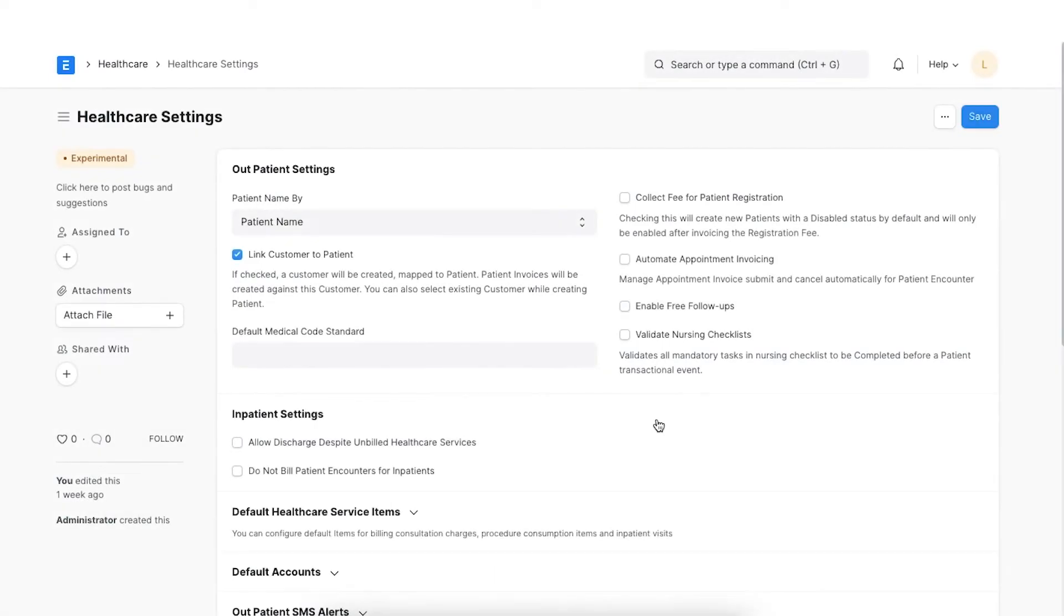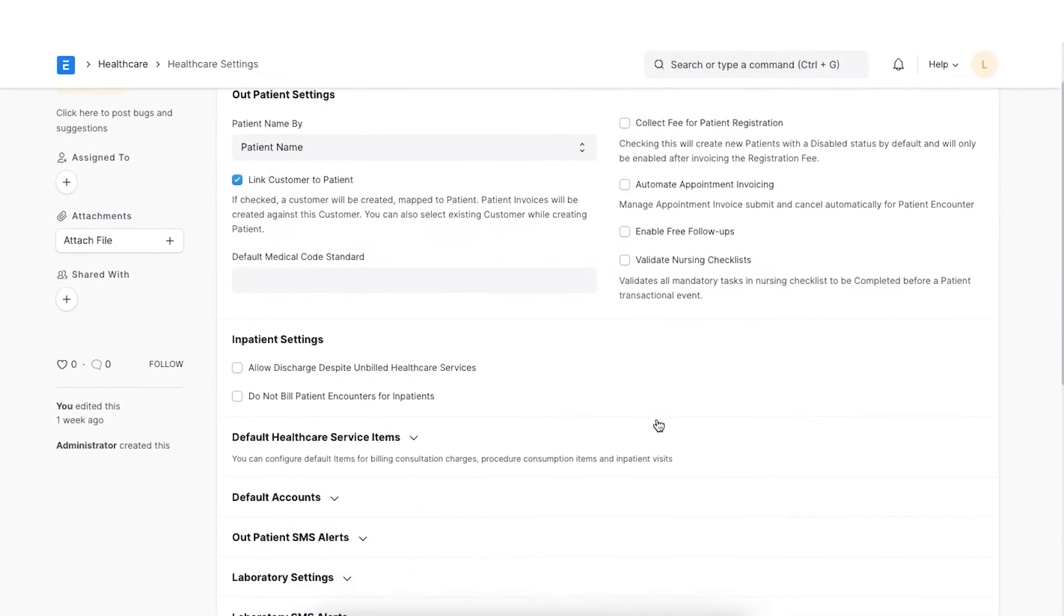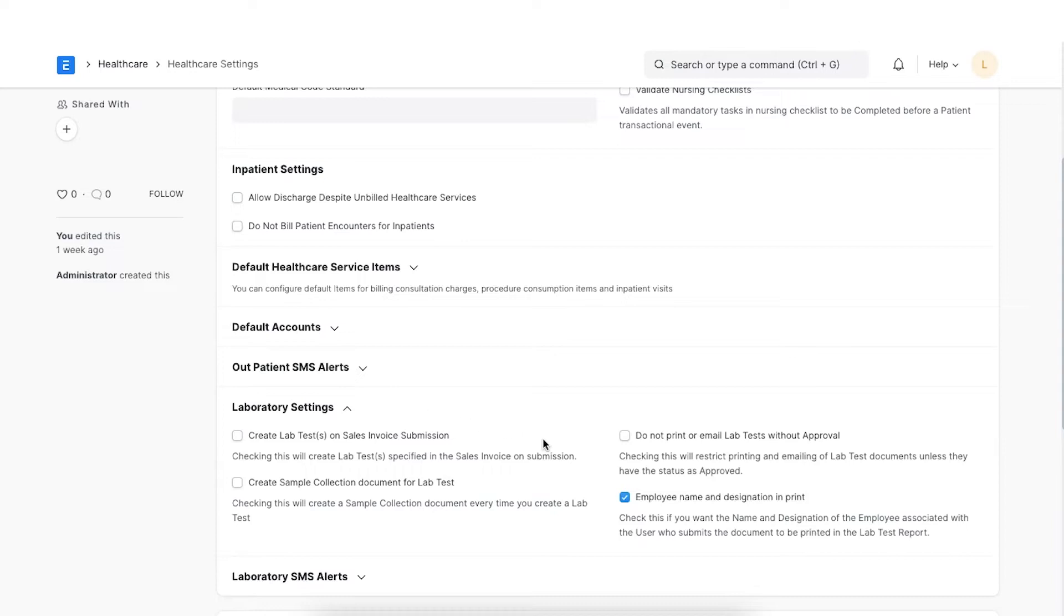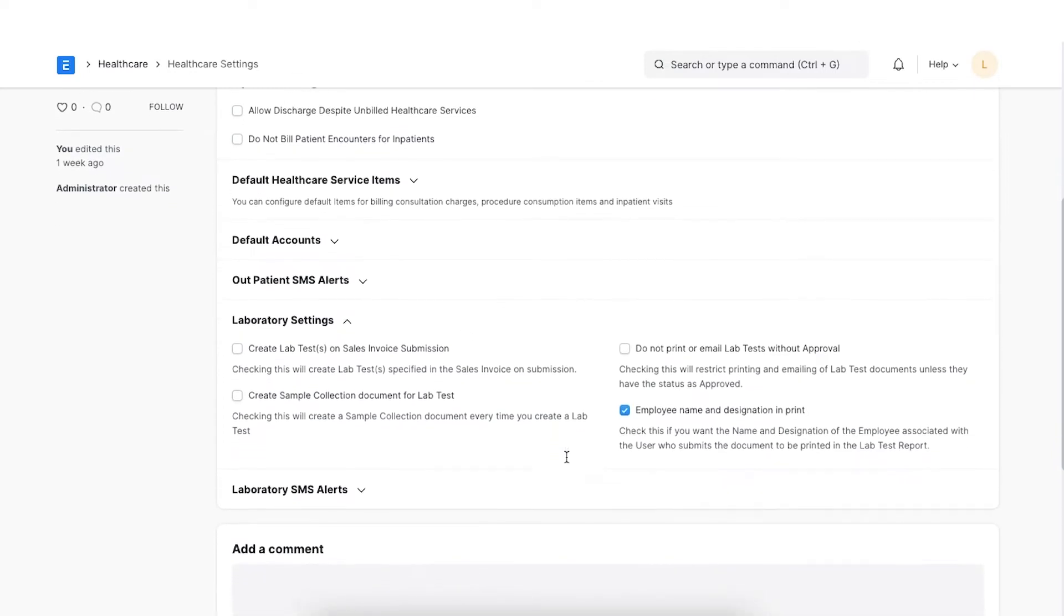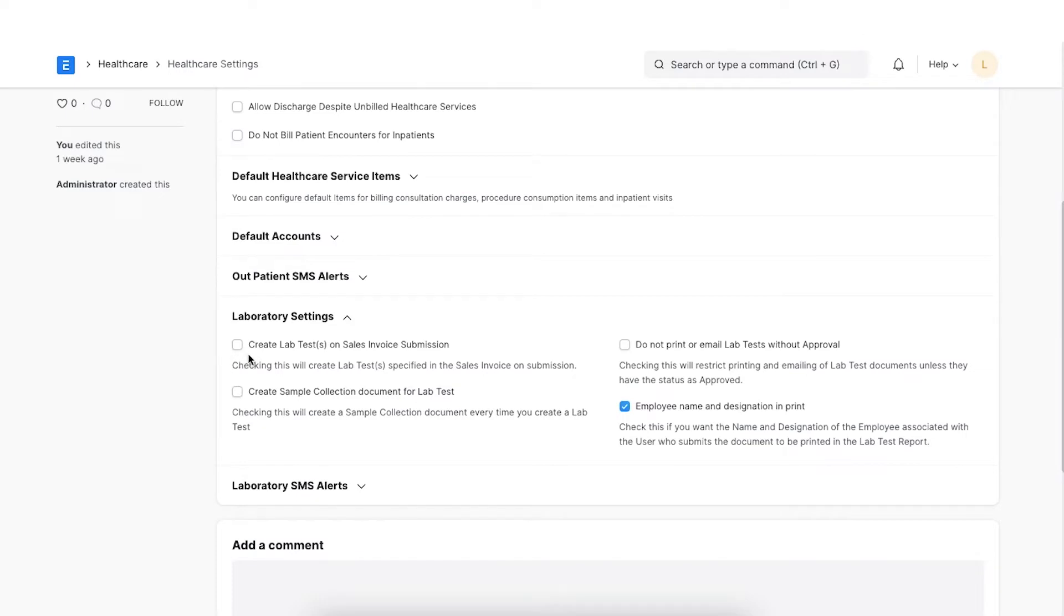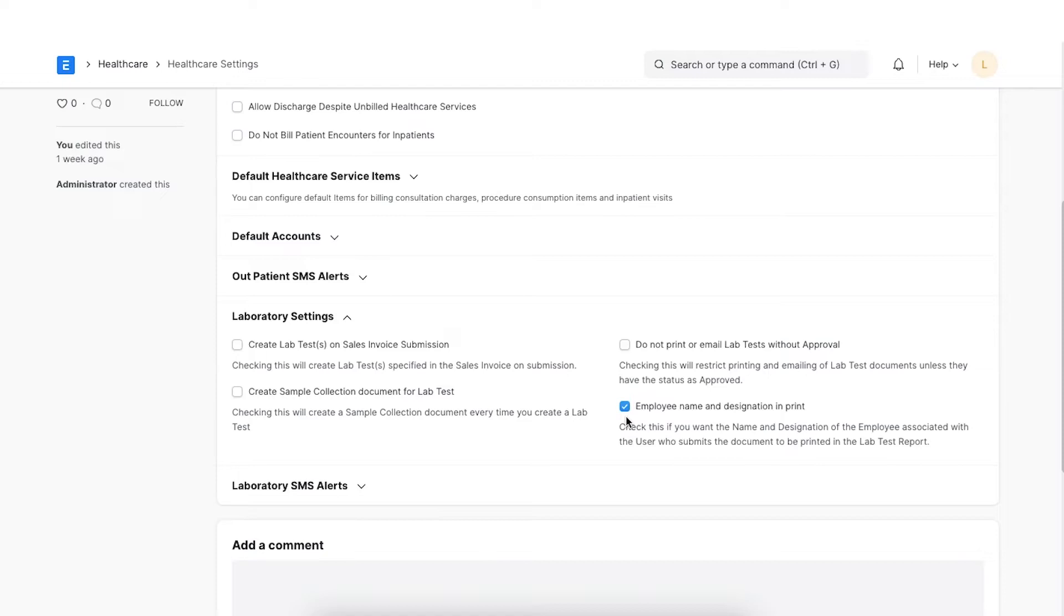In healthcare settings, if the lab test template has sample collection configured, then on creating the lab test, sample collection documents will be created automatically. ERPNext Healthcare also allows the creation of lab tests automatically when any lab tests are billed. This can be configured by enabling Create Lab Test on Sales Invoice Submission. Checking the Do Not Print or Email Lab Test Without Approval checkbox will restrict printing and emailing of lab test documents unless they have the approved status. If we want the name and designation of the employee associated with the user who submits the document to be printed in the lab test report, we can select this checkbox.